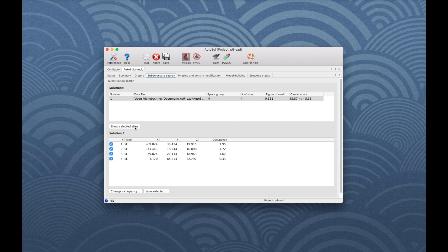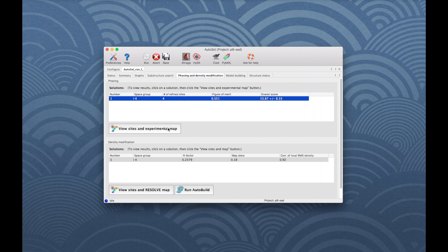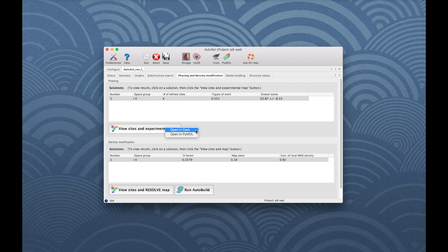The Phasing and Density Modification tab allows visualizing the anomalous sites and density maps from this AutoSol run. Highlight the first solution and click on View Sites and Experimental Map and then Open in Coot.